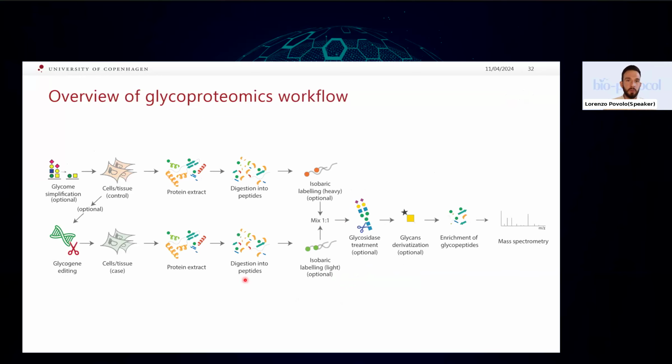And this brings me to the overview of the glycoproteomics workflow as we do it in the Copenhagen Center for Glycomics. So I will leave you this slide here for reference, as a kind of comprehensive view of what we have discussed today and what I haven't discussed but can be done as well. So I would like to very quickly show you a last example of how I applied this workflow and how it was relevant for my research.